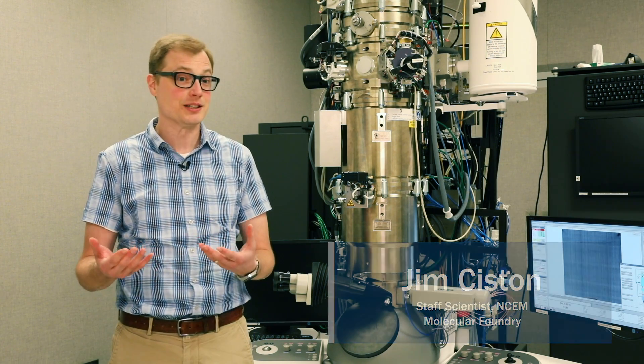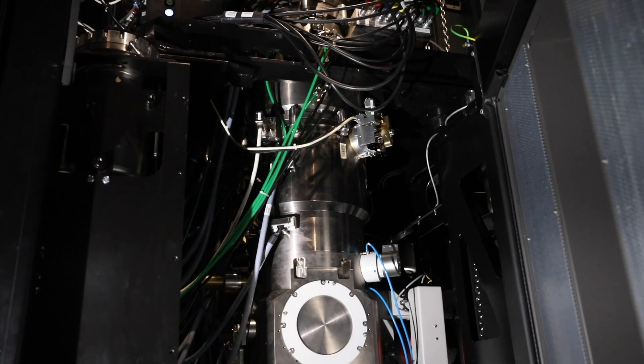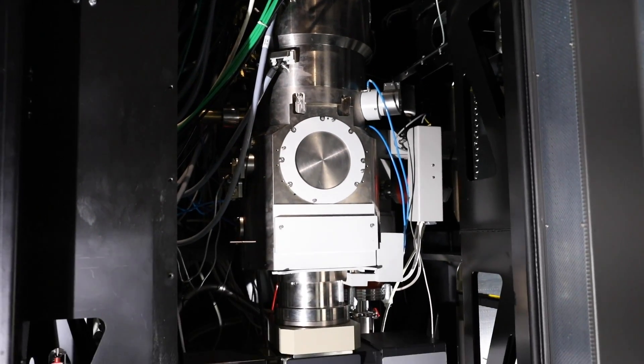The last generation of detectors that was designed here has really come to revolutionize the way we use electron microscopes for biology. This new set of detectors has a lot of implications for how we will study samples in material science.